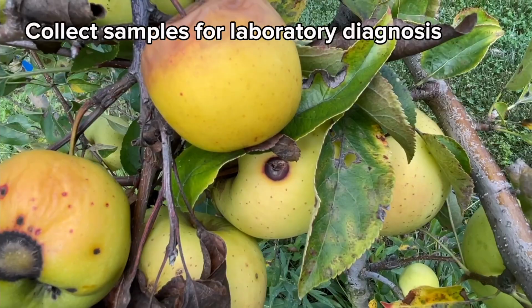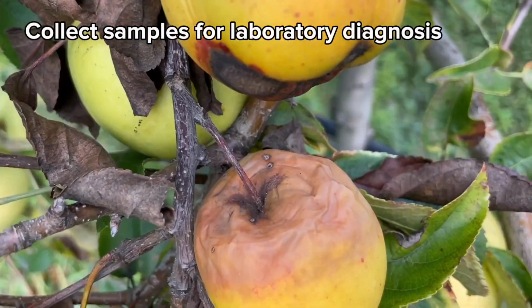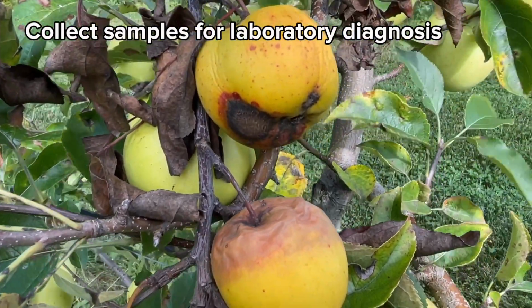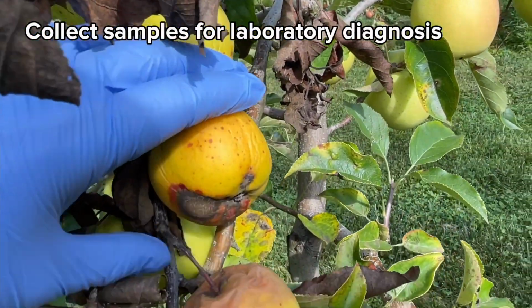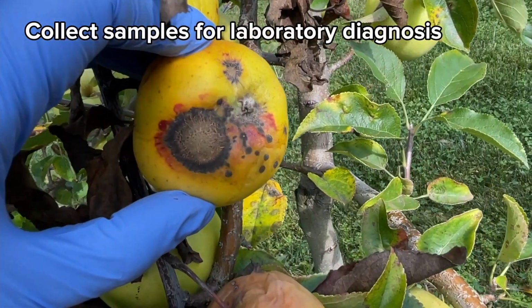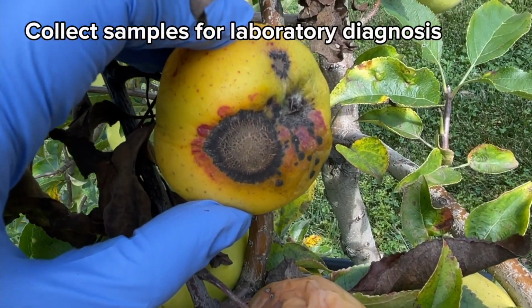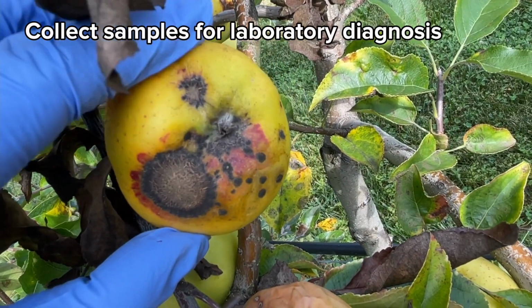When you're collecting samples, be sure to collect samples with noticeable symptoms and signs. However, if the disease has progressed severely to the point where the plant is already dead, do not collect samples from the plant. It may be challenging to find the pathogen, and instead, there is a higher likelihood of discovering saprophytic organisms.